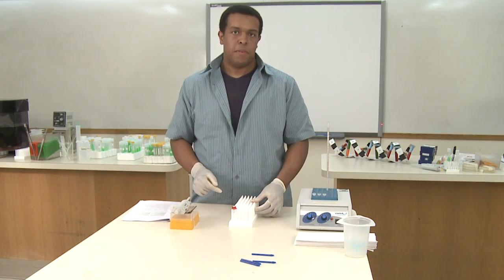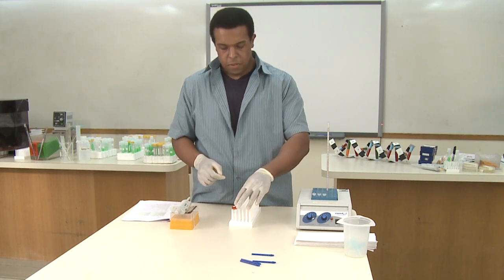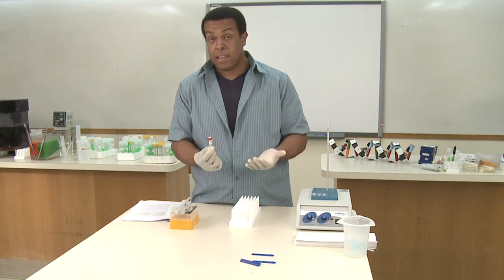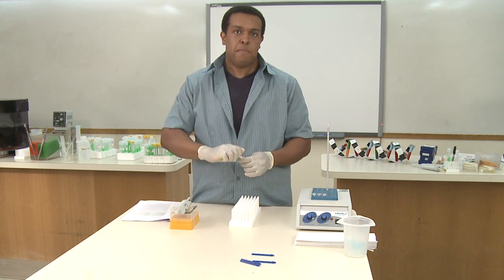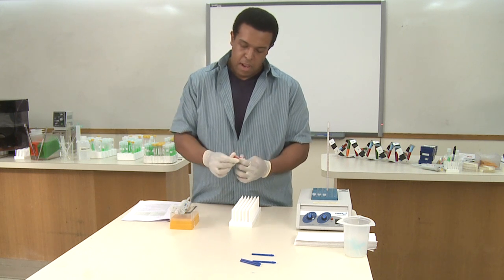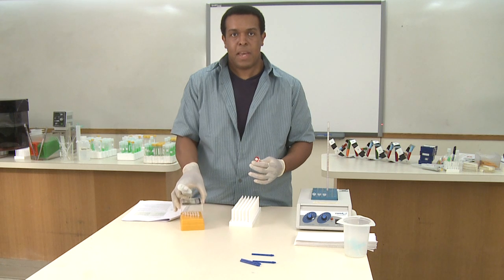Once your samples have incubated for 15 minutes at 65 degrees, you have to add the RNA solution. The RNA solution contains RNase enzyme, and that enzyme is going to break down a lot of the RNA that's present in the solution, so that when we actually precipitate nucleic acids, the majority of what we're going to get back is DNA.